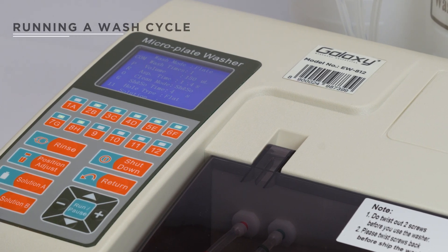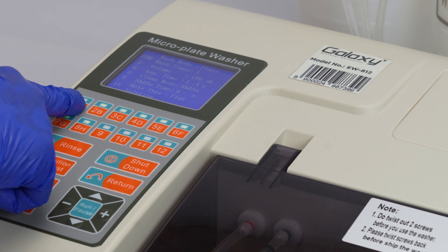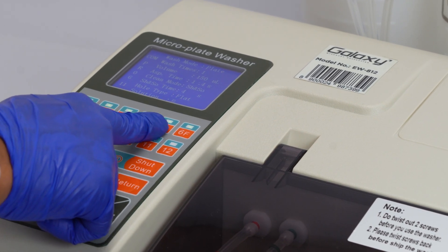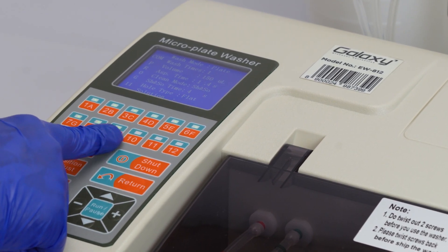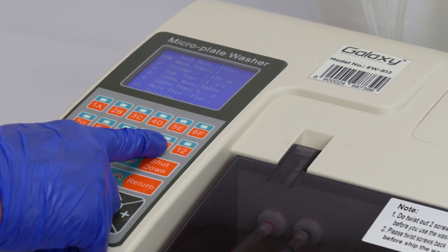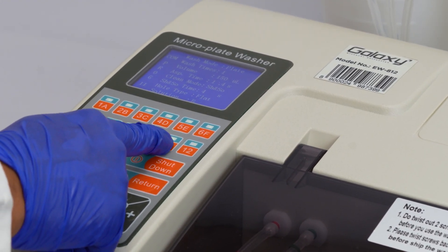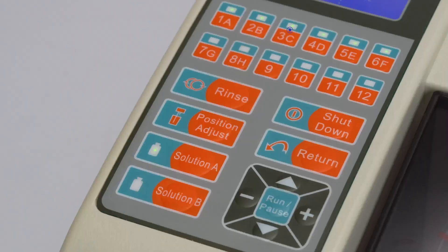Use the washing strips based on the actual sample quantity. Strips 1A, 2B, 3C, 4D, 5E, 6F, 7G, 8, 9, 10, 11 and 12 correspond to each strip. If the indicator lamp is on, it means the strip will be washed.